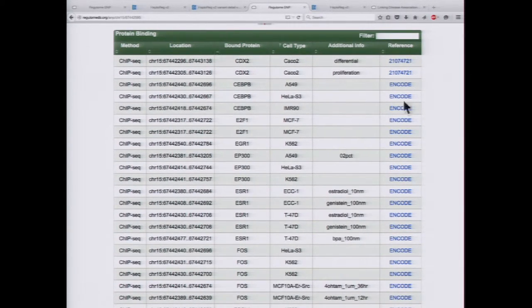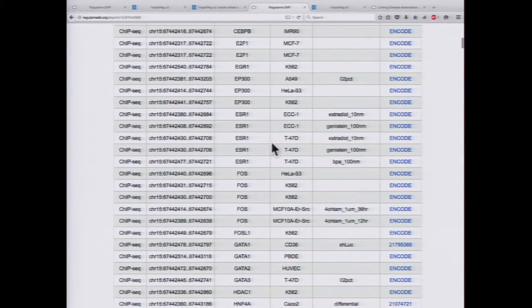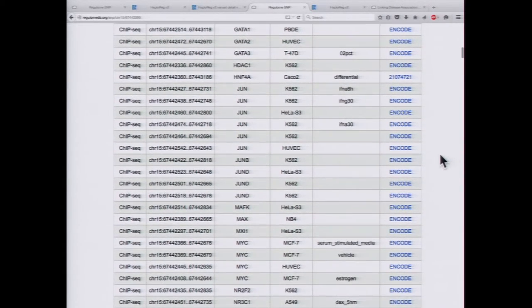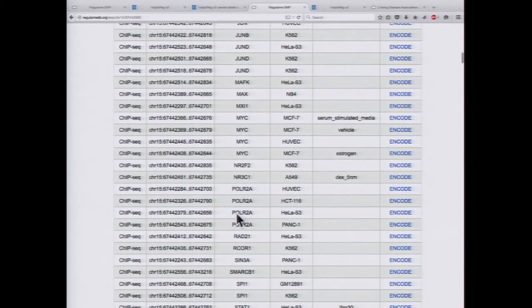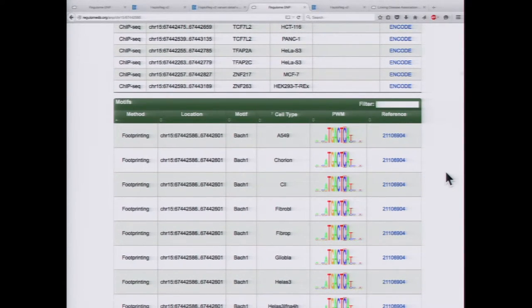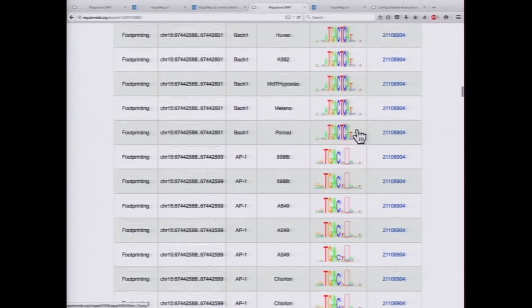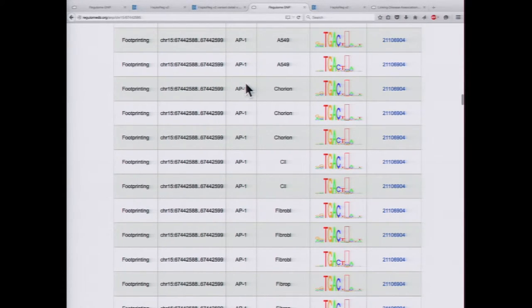Scrolling down, we see there are a lot of proteins bound here. You can sort by protein and see a lot of activity going on in all different cell types. You also notice there's a lot of Jun — a transcription factor bound in this region. We can also see there are a lot of motifs found both by DNA footprinting and by looking at the sequence itself: motifs for Bach1 and motifs for AP1. Jun is actually a component of the AP1 transcription factor, so it's exciting to see a motif for a transcription factor that's bound at that region.